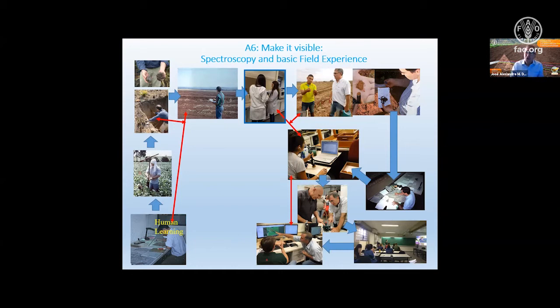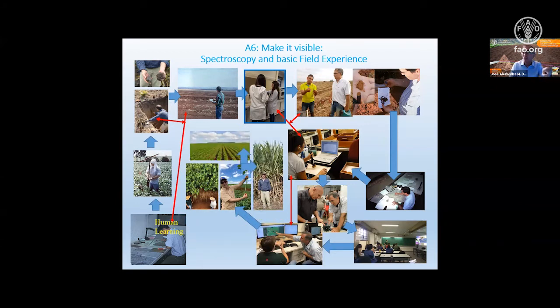That's why spectroscopy is good. You can go further. After all this, I go to the field inside the pit to look at the depth and look at the roots, and link the roots with productivity, which is linked with pedology. And today we have machine learning systems that put everything together, including soil spectroscopy. And this machine learning, of course, will come at the end, for the human decision. So all this sequence gave the strength to talk about spectroscopy.